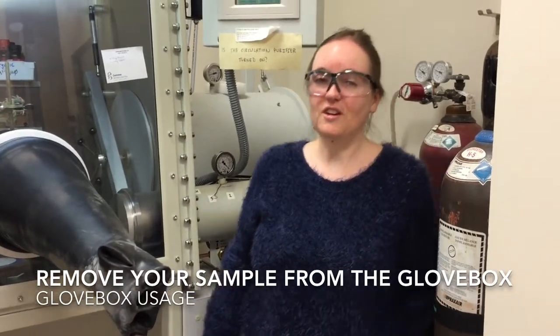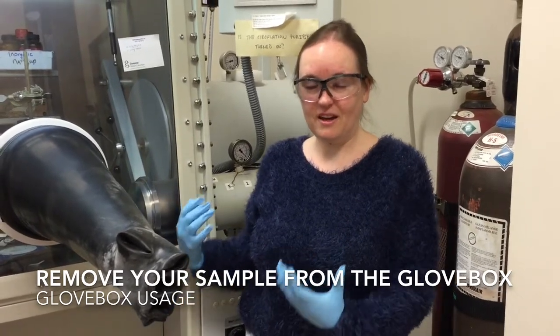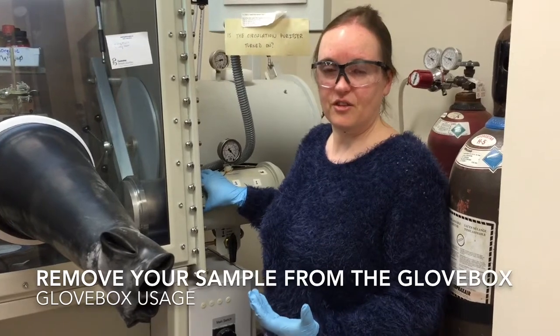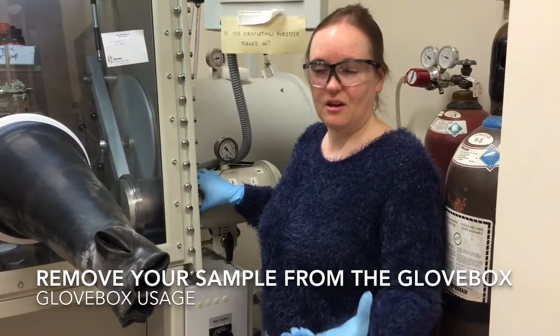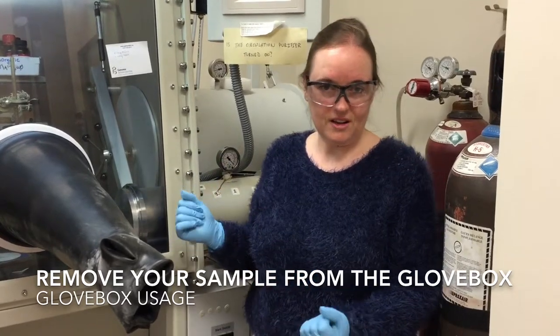I've now finished working with my sample in the glove box and I'm ready to take it back out. The anti-chamber is already full of nitrogen, and I'm bringing it back out into the lab, so I don't have to worry about doing any evacuation.